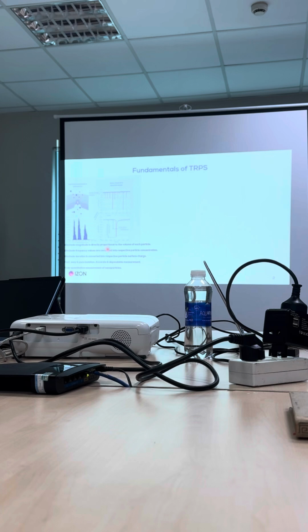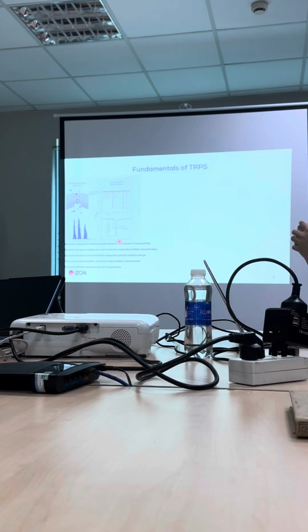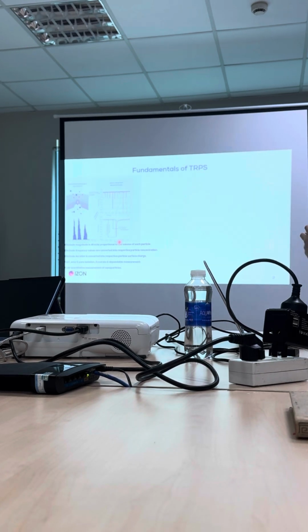And as mentioned, the blockade magnitude is proportional to the volume, the size of the particles, and the frequency can be converted into the particle concentrations. And the duration is related to the surface charge. Some researchers modify their EVs to add some proteins, or conjugate them with RNA, and that will change the zeta potential. You need to test the zeta potential to see whether it's stable in the solutions.